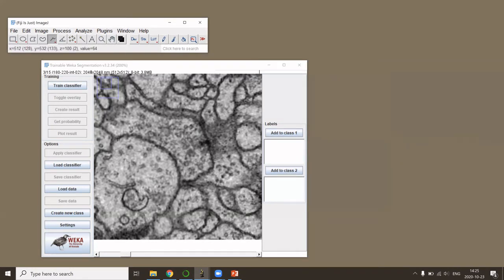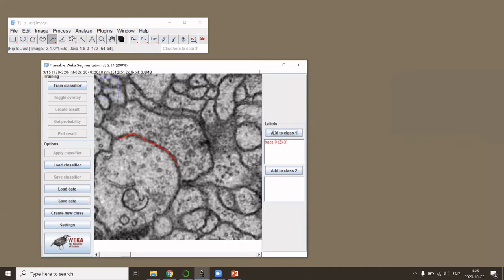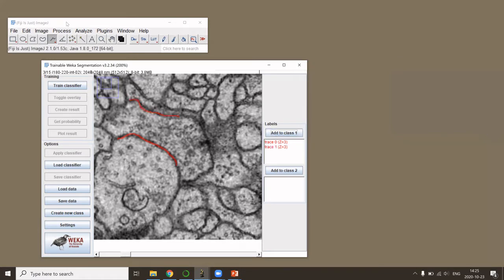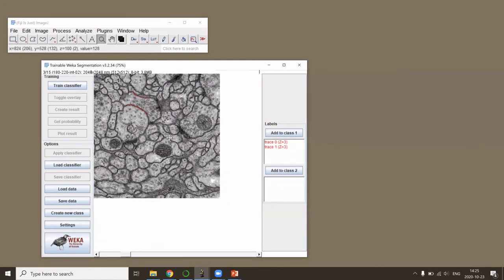What I can now start doing is marking a few pixels that belong to one class, which I define now to be my membrane class. I can zoom out of course and zoom somewhere else, like here, and continue here.